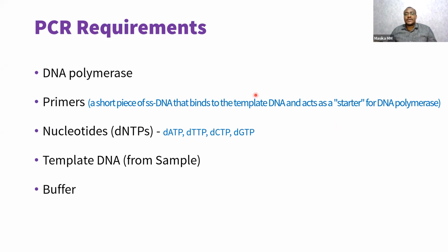The next question here is somebody talking about the sequence of the viruses. Yes, for you to choose a primer, you need to know the sequence of the pathogen. But you also have some primers that are random that can sequence anything. Okay, so is PCR done on viruses with an RNA genome? Yes, it is, but you have to convert the RNA first to DNA. This means that you're getting the gist of this slide. Okay.